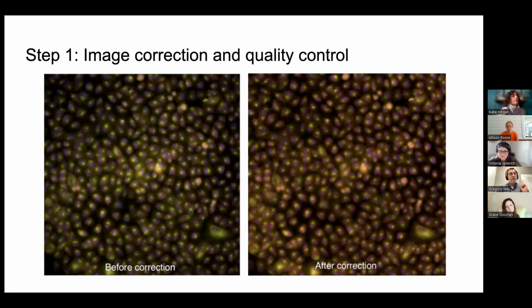Magnify is a tricky word, because magnification is a specific thing in microscopy. But essentially, you want to make sure that you extract features from the cells along the border in the same way that you would extract them from the middle, because there shouldn't be a difference between them. The only difference we would pick up on is a technical one, and we want to avoid picking up on technical things. Reducing the signal from the technical and amplifying the signal from the biological is always the challenge with computational biology.